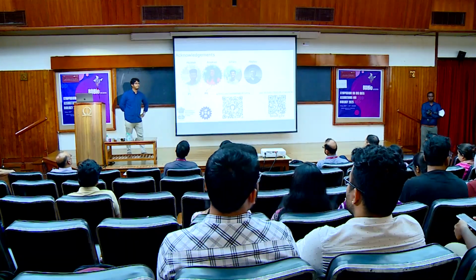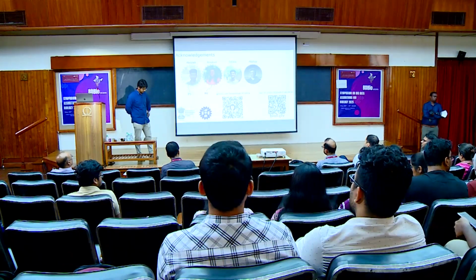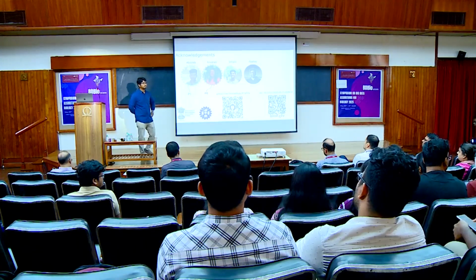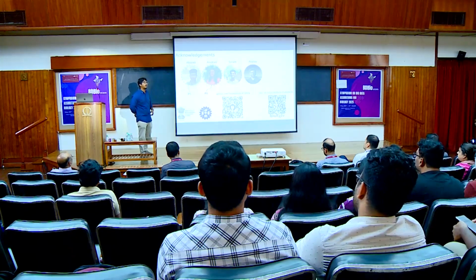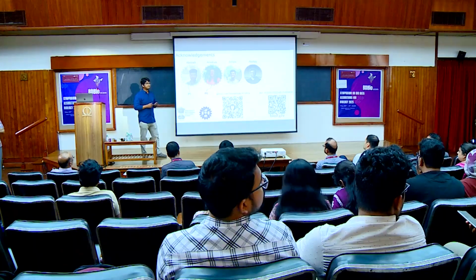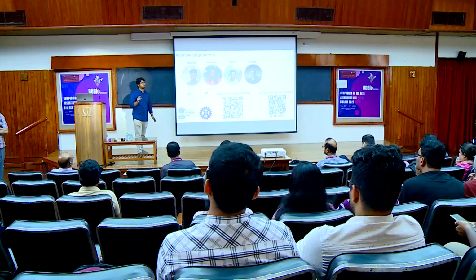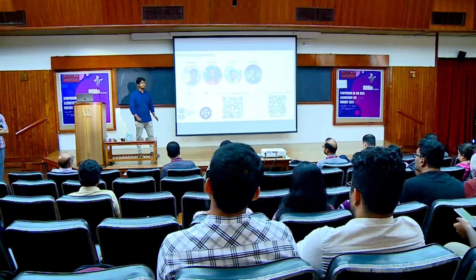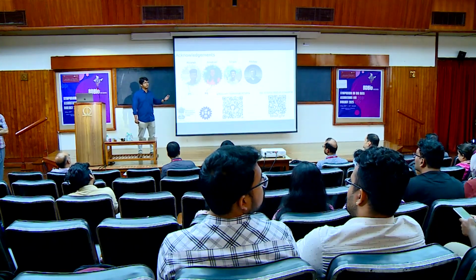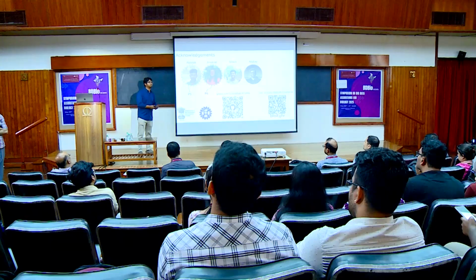Yeah. And one more quick question, you mentioned about phase after that data. What happens if you have compared the exact genome where it is phased and unphased? How does it compare? I am not sure I understand. Oh, right. Haplotagged versus non. Yeah. So I think the accuracy differs by about 0.3% or so. As expected, our heterozygous loci accuracy improves by about 0.5% in haplotagged data, but otherwise overall accuracy does not change much.